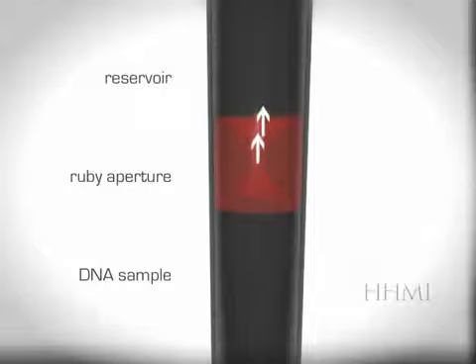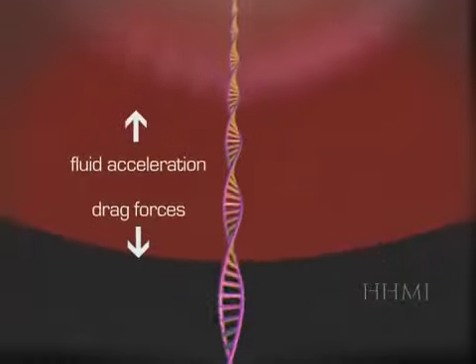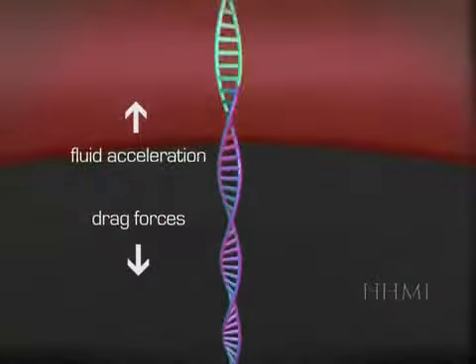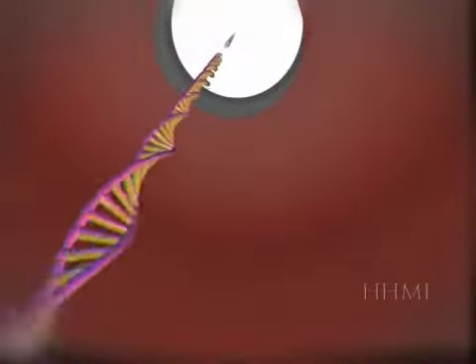As the fluid approaches the aperture, it accelerates to maintain a volumetric flow rate through the smaller area of contraction, like when you put your thumb over the end of a garden hose. As part of the DNA gets forced through the hole with the fluid, the drag forces of the fast-moving liquid in the aperture pull the end of the long strand of DNA and stretches the DNA until the end snaps off. With constant pressure, pieces of DNA of consistent size are pulled from the longer strand.